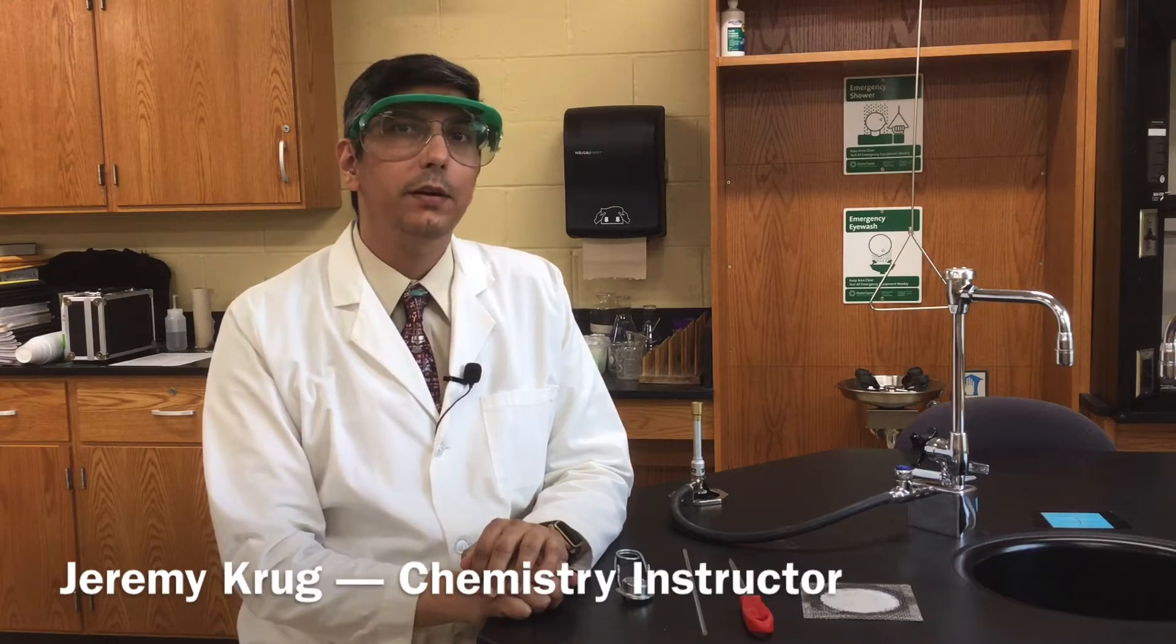Welcome to my chemistry lab. I'm Jeremy Krug and in today's video we're going to learn how to bend glass and cut glass and fire polish glass using a Bunsen burner.